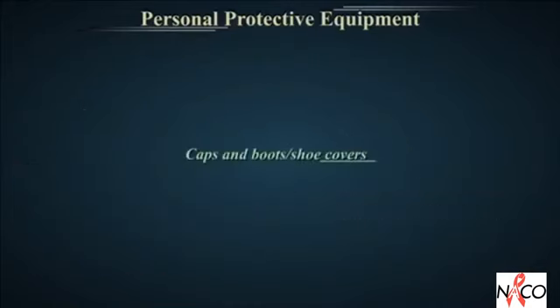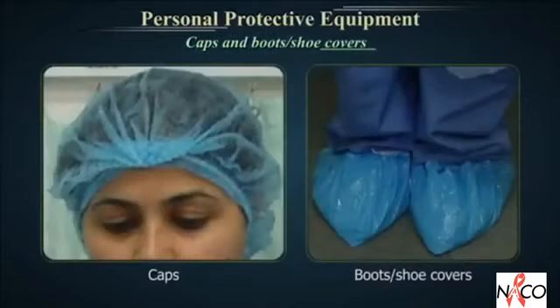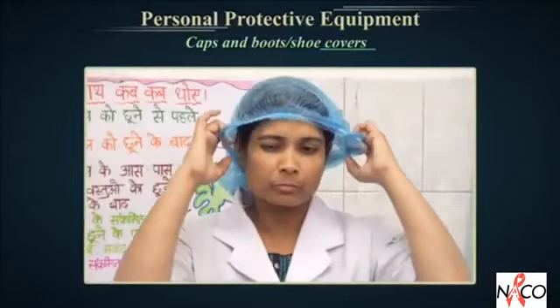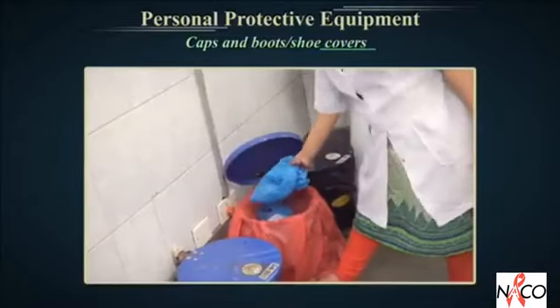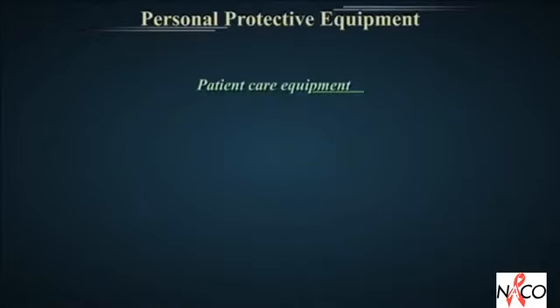Caps and boots or shoe covers. Wear caps and boots or shoe covers where there is a likelihood that the patient's blood, body fluids, or other infectious material may splash, spill, or leak into the hair or the shoe. Launder caps and shoe covers appropriately if they are reusable, according to institutional policy. Discard used caps and shoe covers in a red bag. Do not reuse disposable caps and shoe covers. Clean reusable boots.